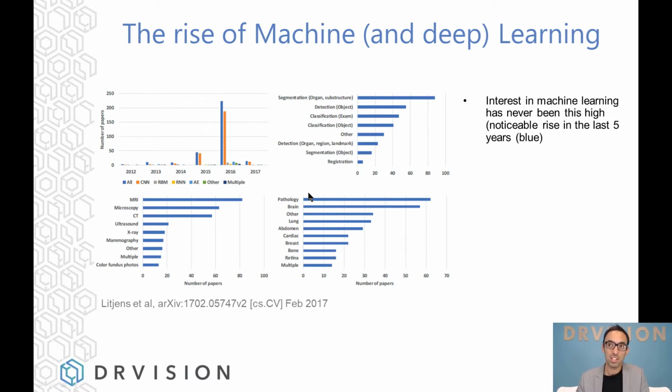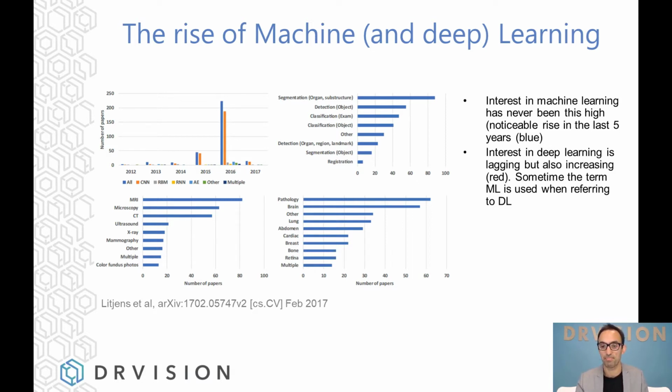And it's not surprising because, of course, those fields tend to be a little bit ahead when it comes to use of this kind of technology. In this case, they certainly are. So there is still a lot for us to catch up, I think. And the trend is obviously it's increasing, or the number of papers is increasing, so the trend is upwards.